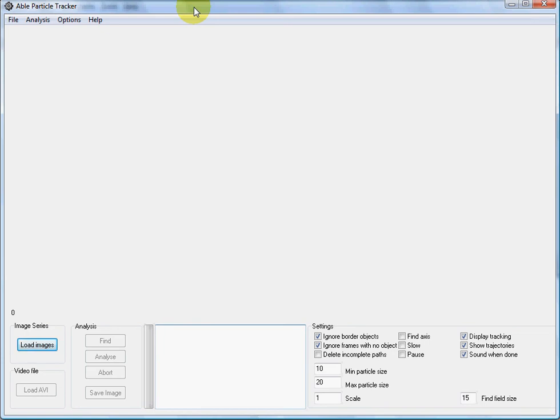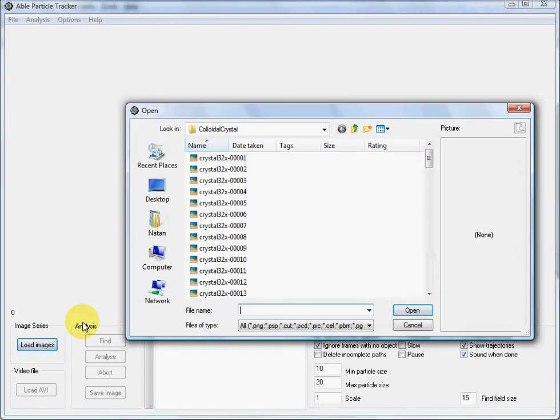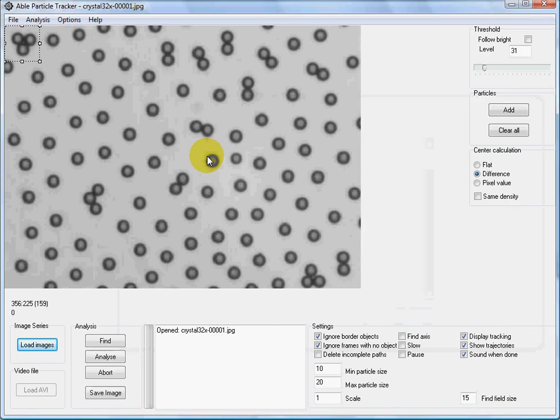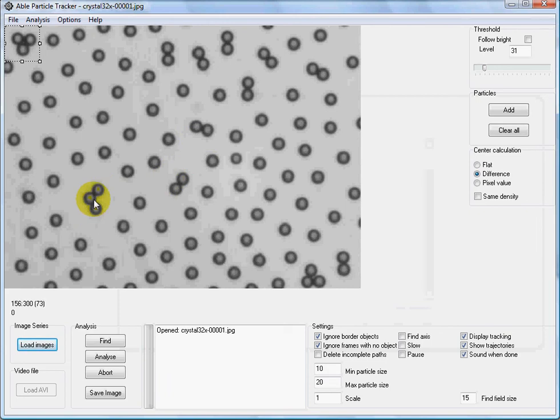I will demonstrate how to use AbleParticleTracker to track only a single type of particle. First, let's open the image. As you can see, we have single particles, doublets, and triplets in this video.